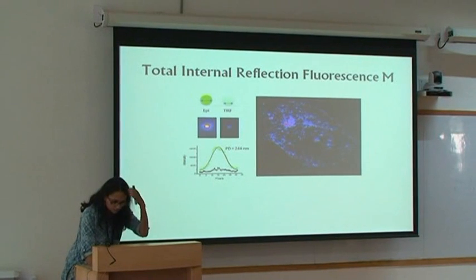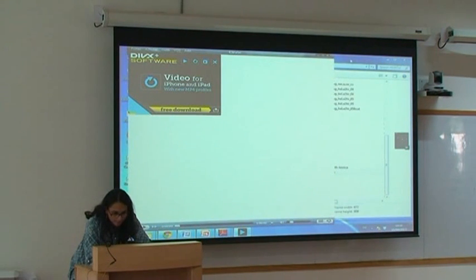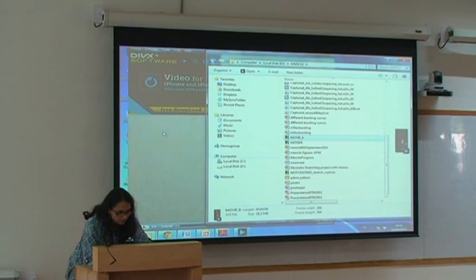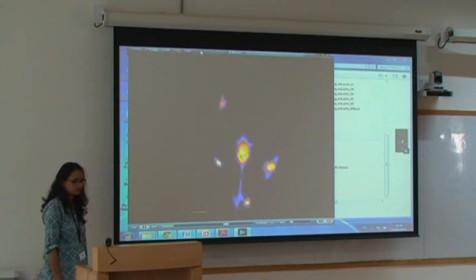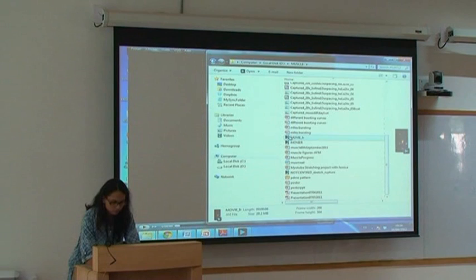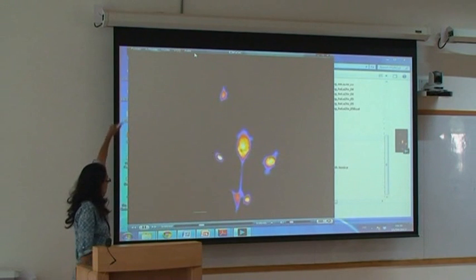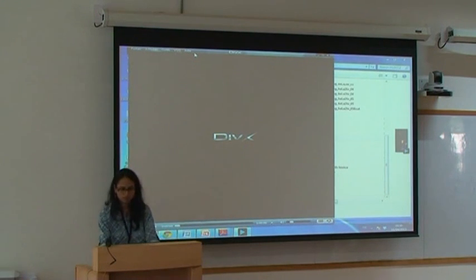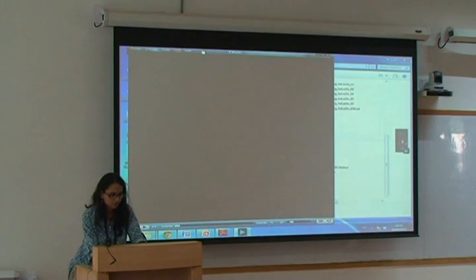Okay, this was to show you that we can do this, but there was some problem with the movies. Let me show you 2 movies. Let me show you a nice movie first. Okay, these are myotubes. The bar is, I think, 100 microns, or no, that's 50 micron. Don't worry about what they're loaded with, that's just to mark the volume. You see that it can stretch like that, and you see this cell, suddenly the intensity changes. So this cell has basically burst, okay? And the other cells are not bursting. Such events of bursting are really, really rare. So let's see that again.